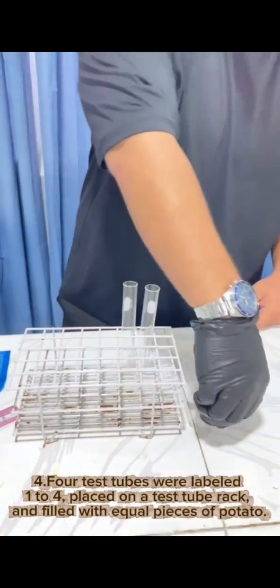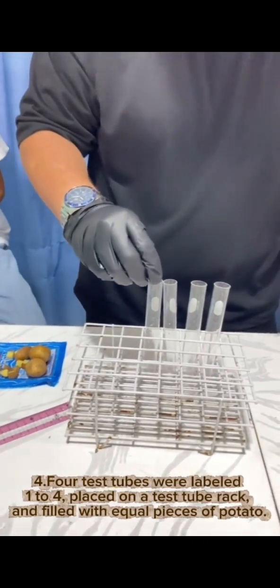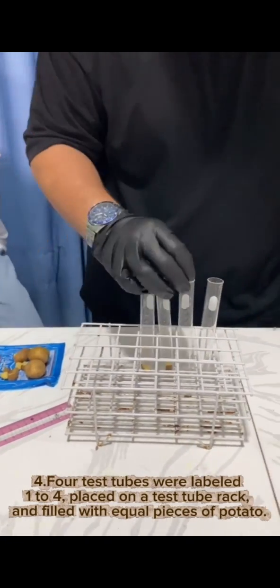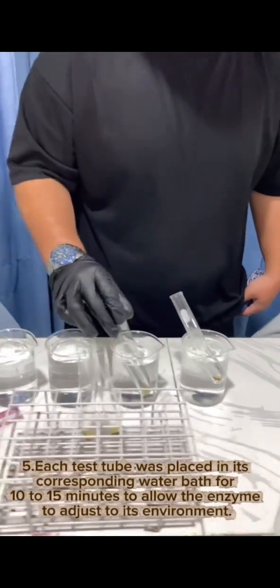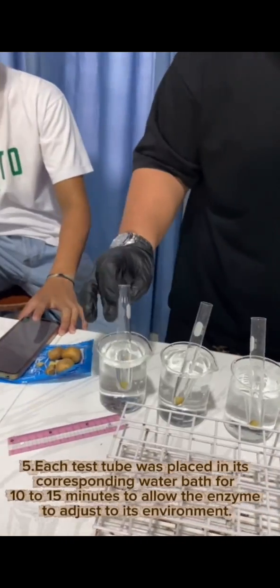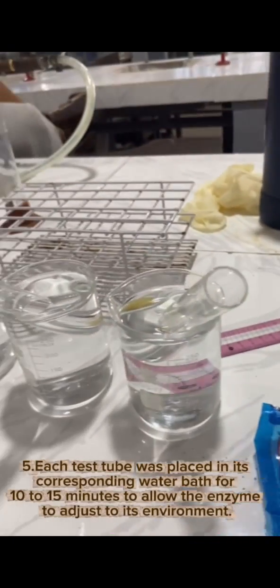Four test tubes were labeled 1 to 4, placed on a test tube rack, and filled with equal pieces of potato. Each test tube was placed in its corresponding water bath for 10 to 15 minutes to allow the enzyme to adjust to its environment.